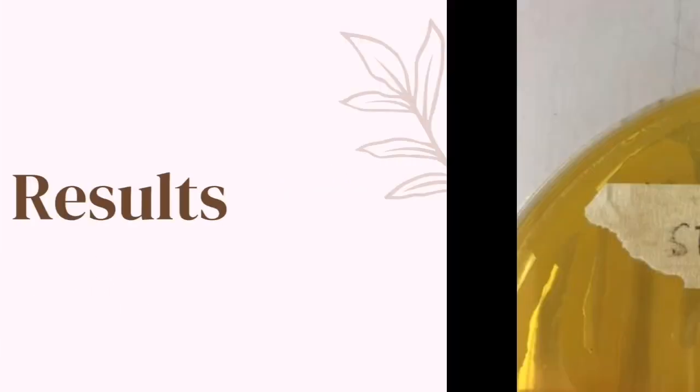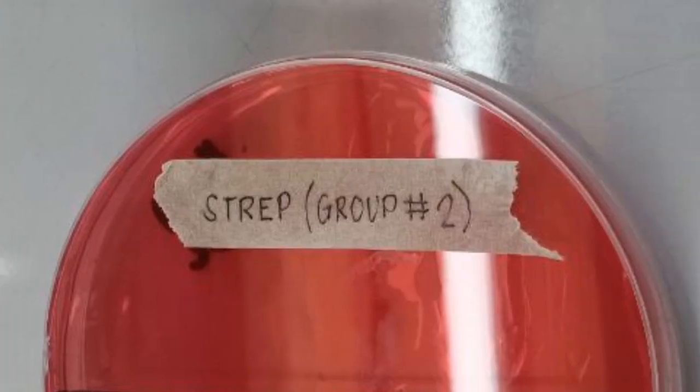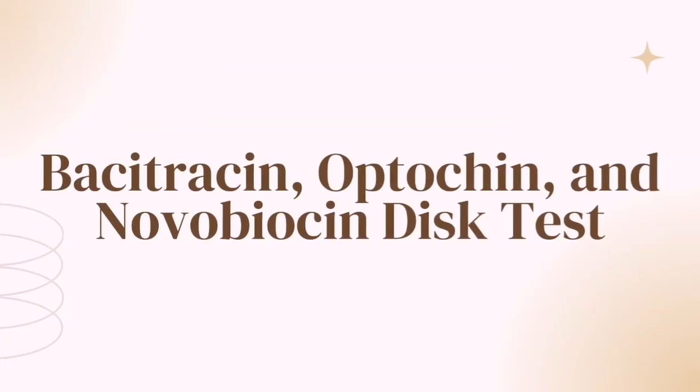Here are the results. For Staphylococcus, it is observed that there is growth and there are yellow halos around the colonies, which indicates that it is a mannitol fermenter. On the other hand, for Streptococcus, there is minimal growth and there are no yellow halos around the colonies, which indicates that it is a non-mannitol fermenter. For the last activity, we have the bacitracin, optochin, and novobiocin disc test.